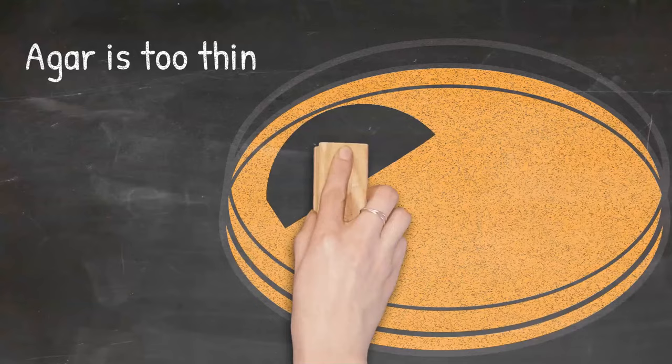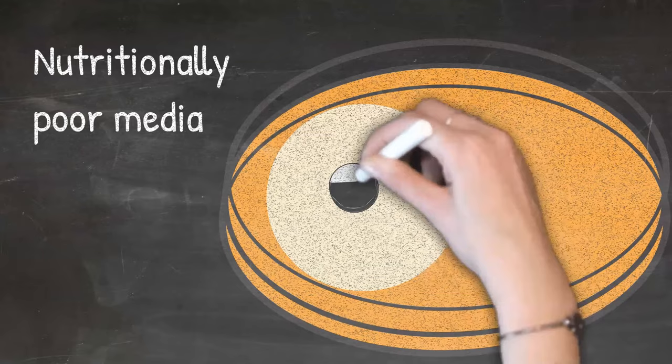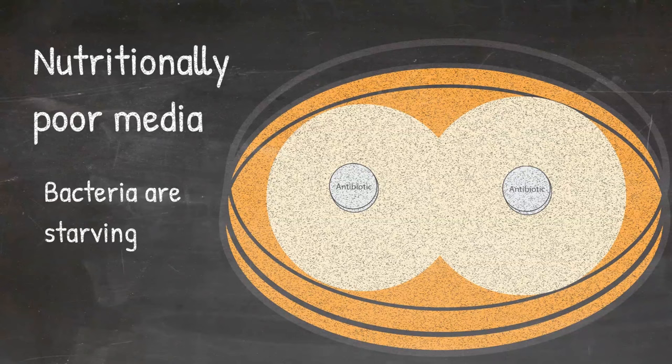When the agar is too thin, the antibiotic spreads more laterally, which leads to a larger zone of inhibition. If the media is nutritionally poor, the bacteria is not at its optimal growth condition. Growth rate decreases, so larger zone inhibition is observed.